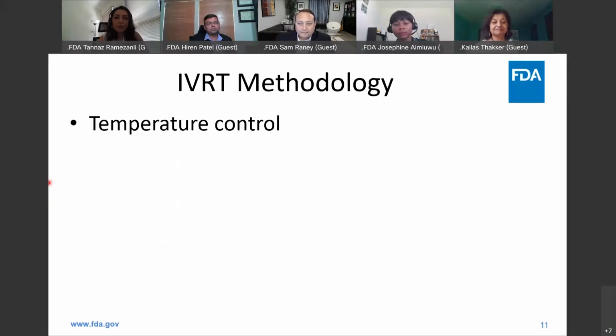Okay, and next bullet point, because I think the temperature control was discussed, what temperature needs to be monitored and controlled and maintained. I think you covered that in your presentation, and Christina showed how they control the surface membrane temperature. So I think let's go to the next topic, which is the back diffusion.